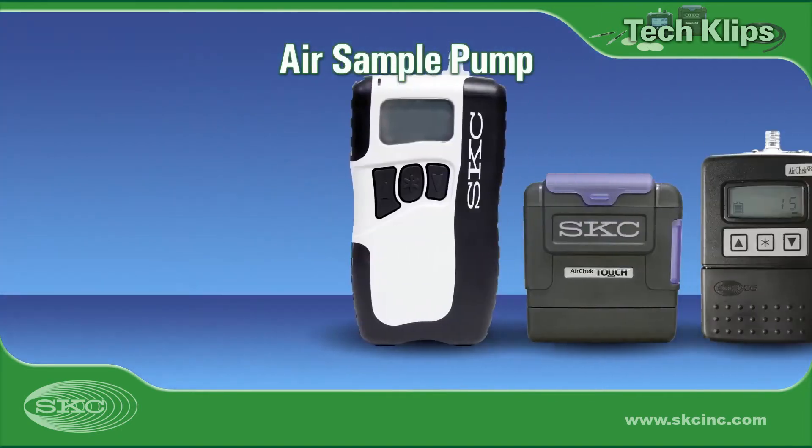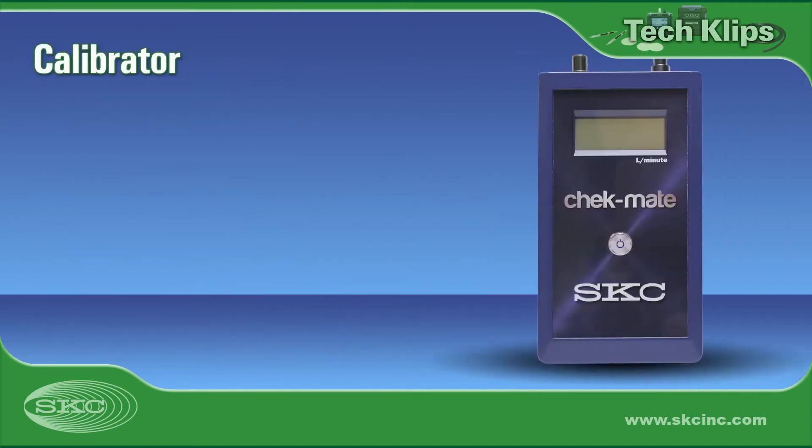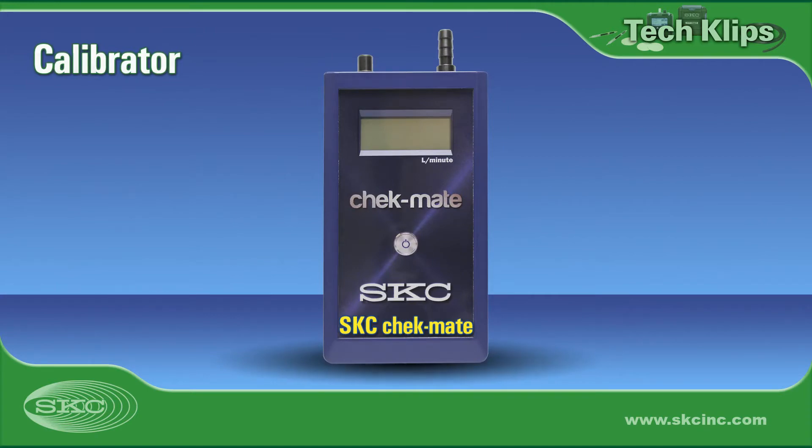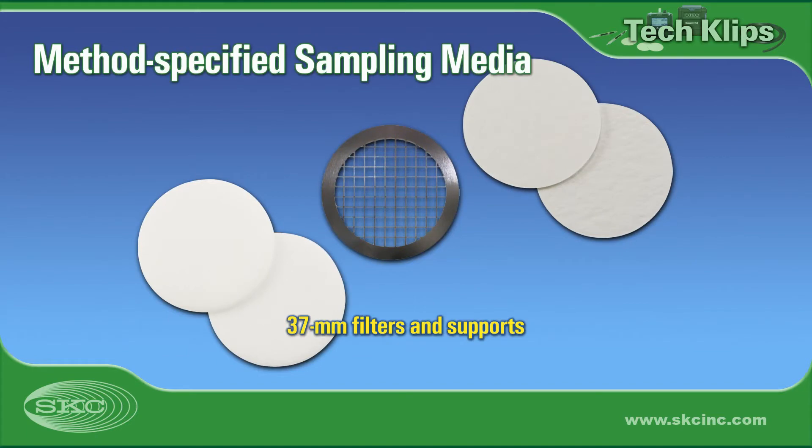Choose a constant flow air sample pump capable of 8, 4, or 2 liters a minute. Select a calibrator within the pump's flow range. Use method-specified MCE, PVC, or PTFE filters and supports.